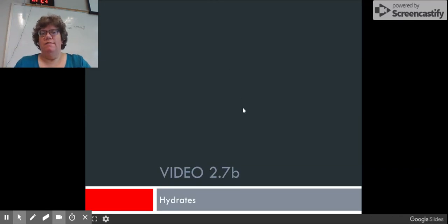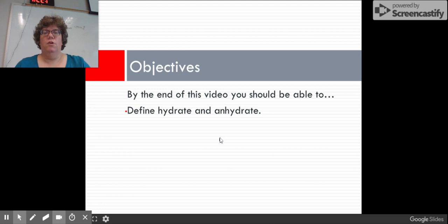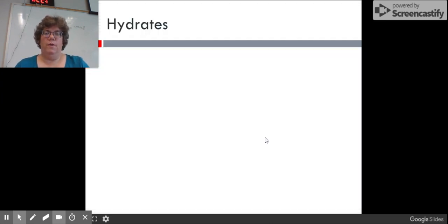Video 2.7b is all about something called hydrates. I really want you to pay close attention to this video because it is going to describe in detail a lab that we are going to do this coming week. So by the end of this video, hopefully you'll be able to define the terms hydrate and anhydrate, and then have a good insight into the lab we're going to do this week.